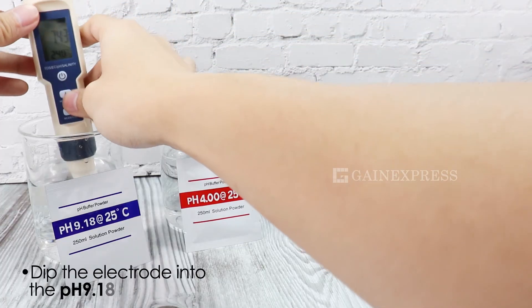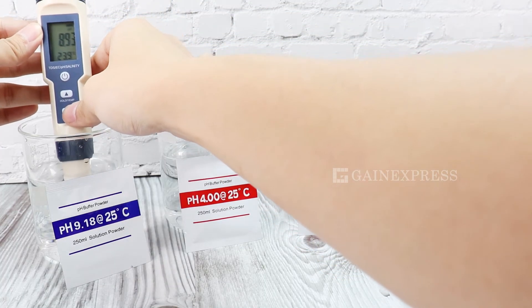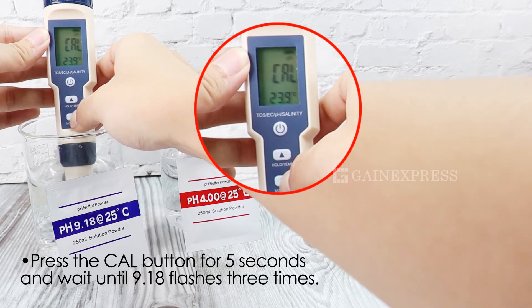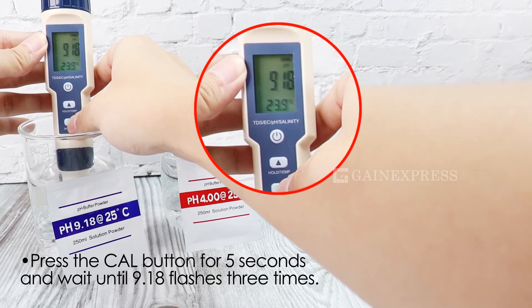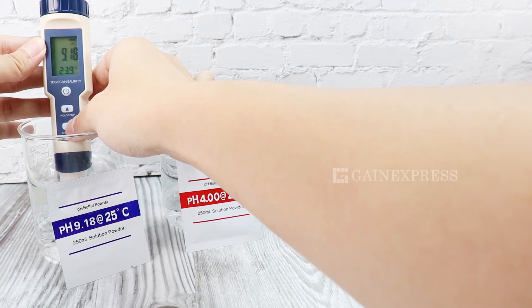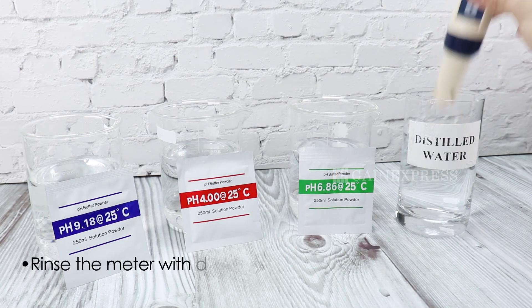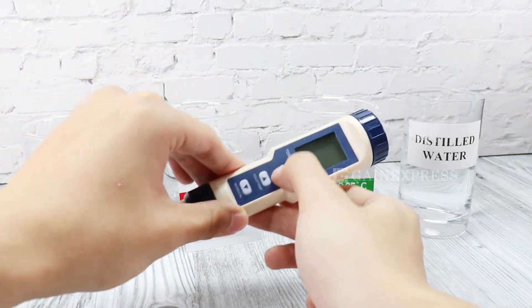And lastly, dip the rinsed electrode into the pH 9.18 solution. Wait until the value becomes stable. Press the CAL button for 5 seconds and wait until 9.18 flashes 3 times. Clean the electrode with distilled water and dry it. The calibration is done.